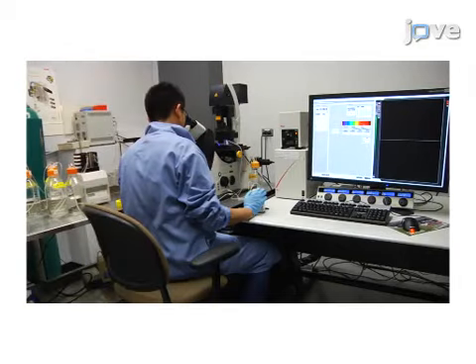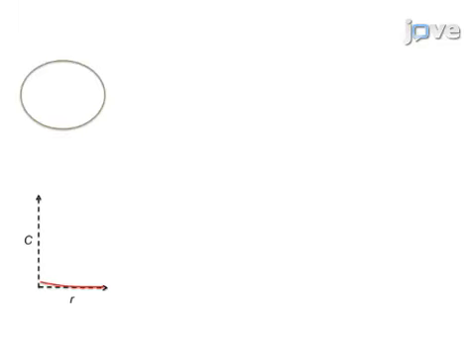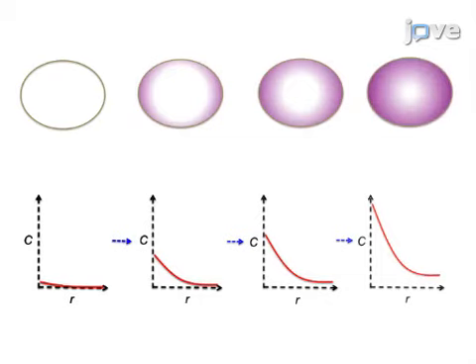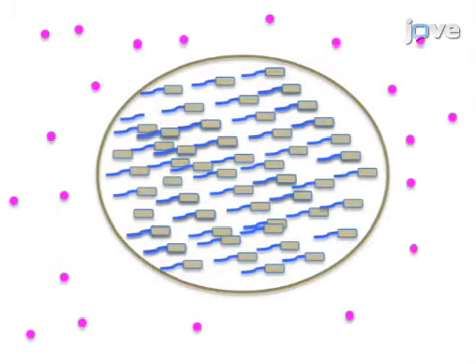Bacteria are added to the system, and biofilms are allowed to develop over the course of several days. The biofilms are then imaged by 3D confocal microscopy. To characterize solute transport within biofilms, fluorescent tracers are injected into the flow system and time-lapse imaging is performed. To characterize the flow field around biofilm colonies, fluorescent microbeads are injected and time-lapse imaging is performed.